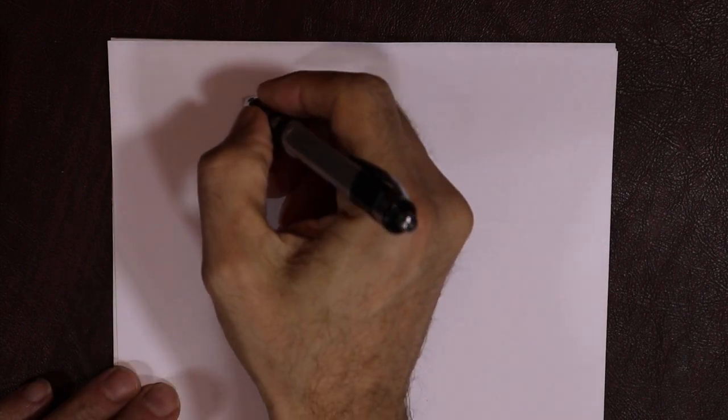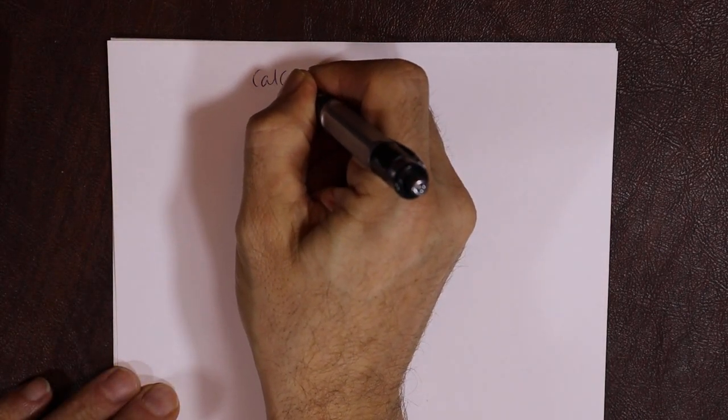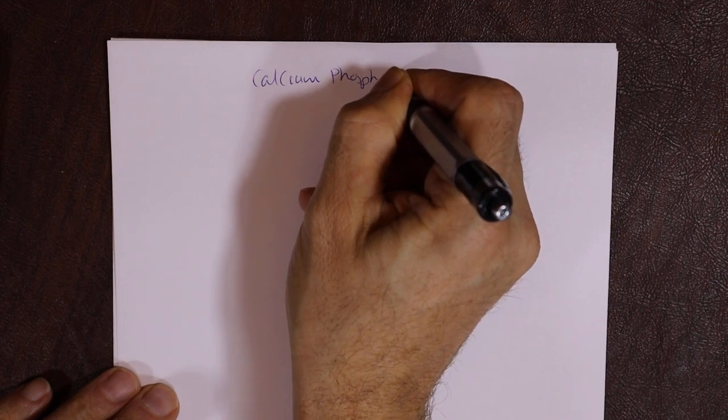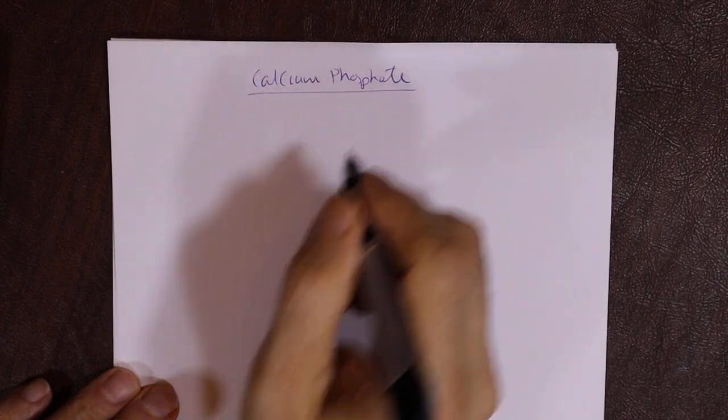Hi everyone, what I want to do is talk you through your first lab here, okay? So, we're going to talk about precipitating calcium phosphate. You've actually done this lab, okay? Unfortunately we couldn't finish it because our stuff's still in the fume hood drying, right?